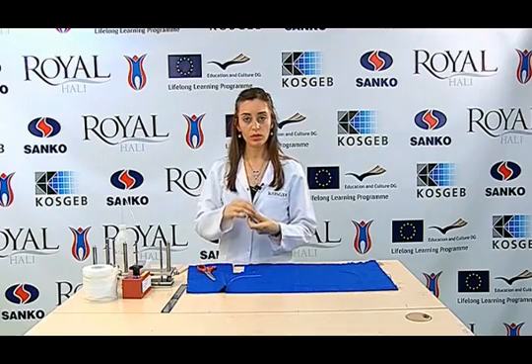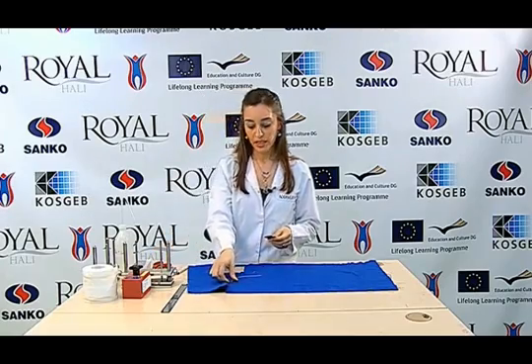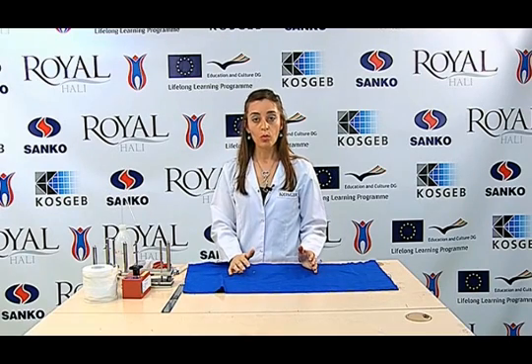In this way, I have prepared the sample. If the sample is fiber or yarn and not a fabric, the amount of fiber or yarn that is used must be half of that of the adjacent fabric weight. The sample is prepared by sewing the adjacent fabric to one side of the sample and the non-dyable polypropylene fabric to the other side.